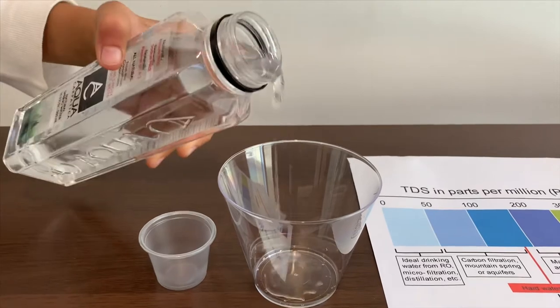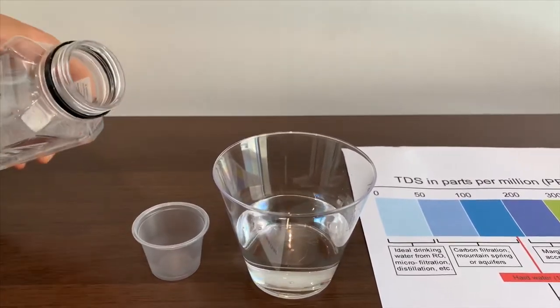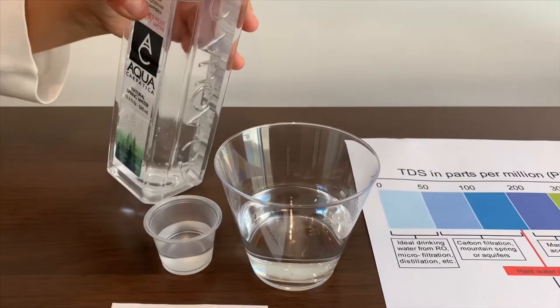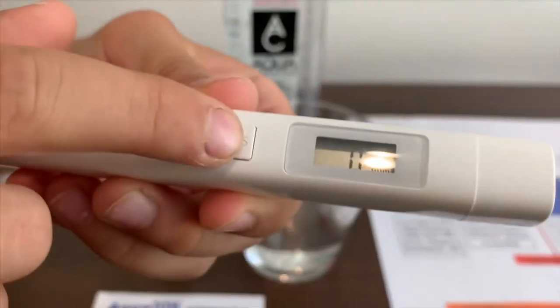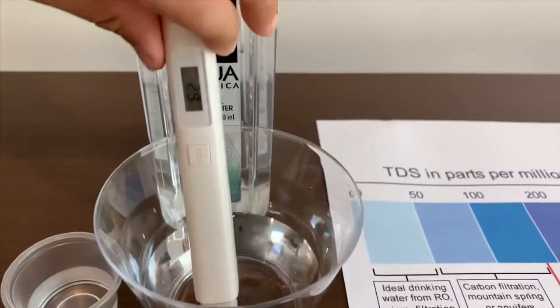We are going to test the pH and TDS. First, we are going to test the TDS. Turn on the TDS tester, make sure it says 0, and put it in.